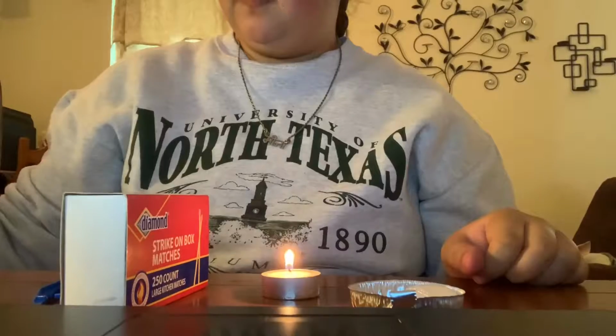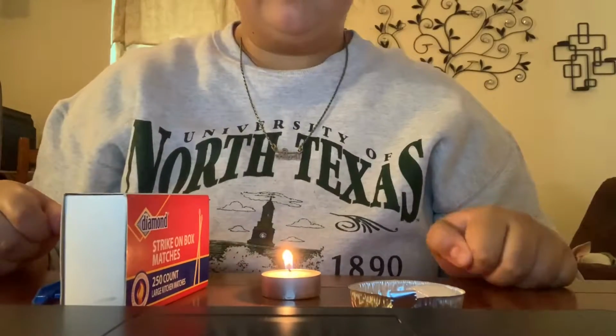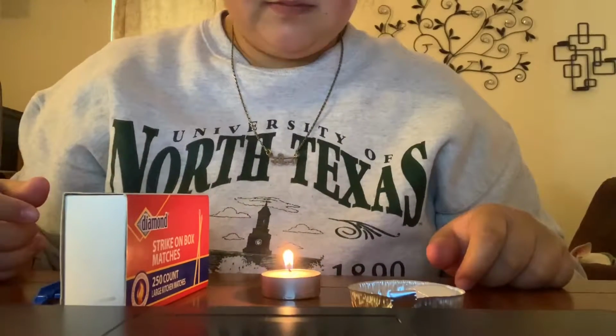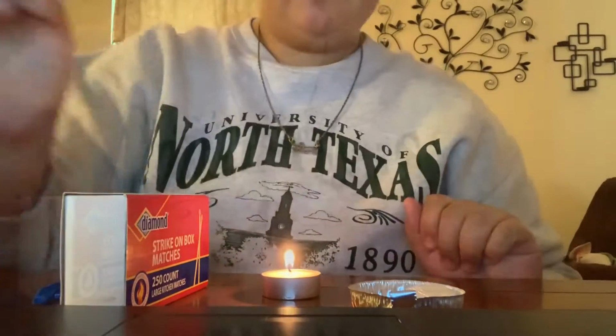I will observe the candle being lit for a few minutes while I make sure that the match does not catch anything else on fire. Cool. It's melting. Wax is turning clear, but we all know it'll harden again, so cool.